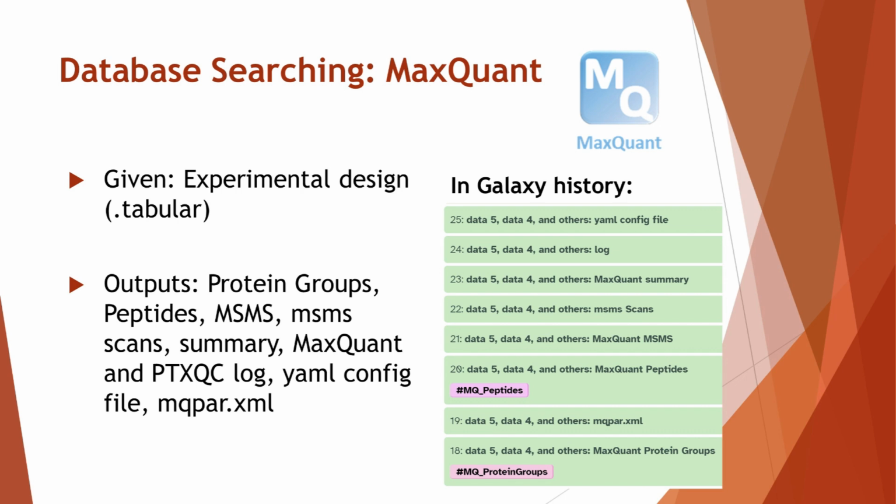So, how does MaxQuant work? MaxQuant is a mass spectrometry-based proteomics platform that is capable of processing raw data, meaning we do not need to convert the raw data to MGF like we did for SearchGUI. So, in our analysis, raw MS spectra will be searched against the protein sequence database. MaxQuant also provides improved mass precision and high precursor mass accuracy. This results in increased protein identification and more in-depth proteomic analysis. MaxQuant outputs will include protein groups and peptides, as well as other files that will give information about identified peptides.